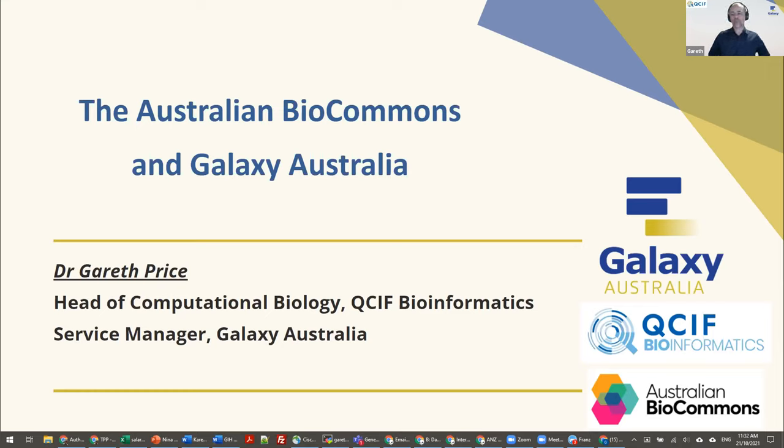So I've got the privilege of talking to you about, I'll use an emotive word at the start, a free service to all Australian researchers. What this actually is, is a nationally funded service, which is free for researchers to use, on the basis that if we build it, they will come, and it will be used, and it will reduce the hurdle for researchers to do their computational analysis.